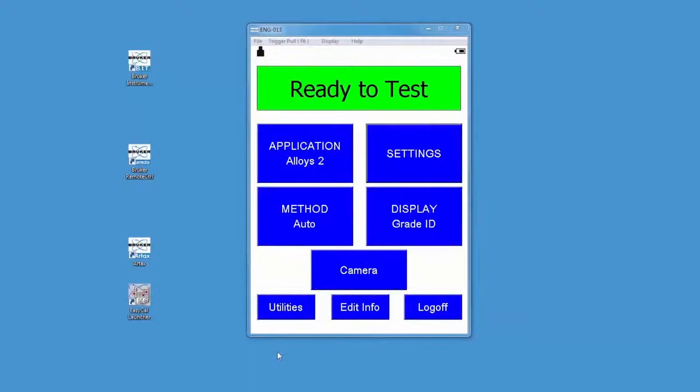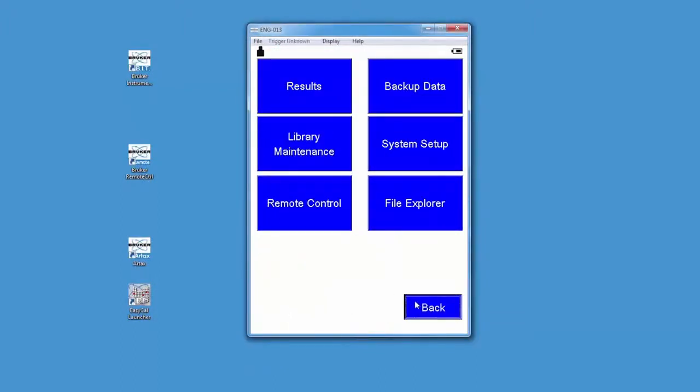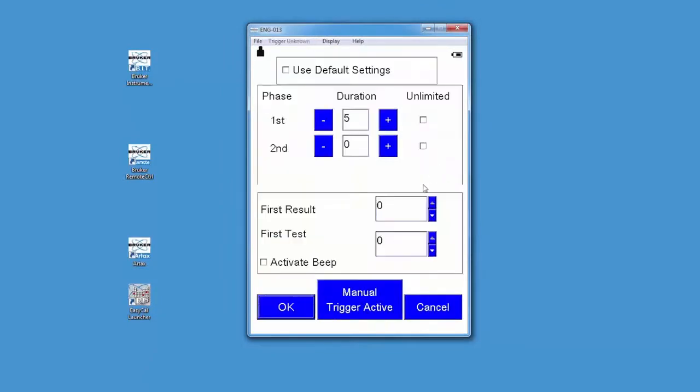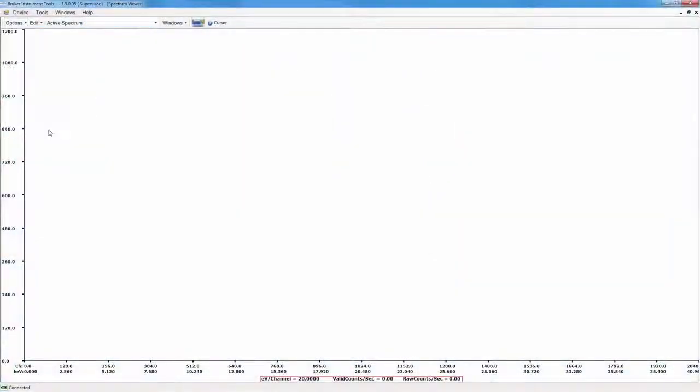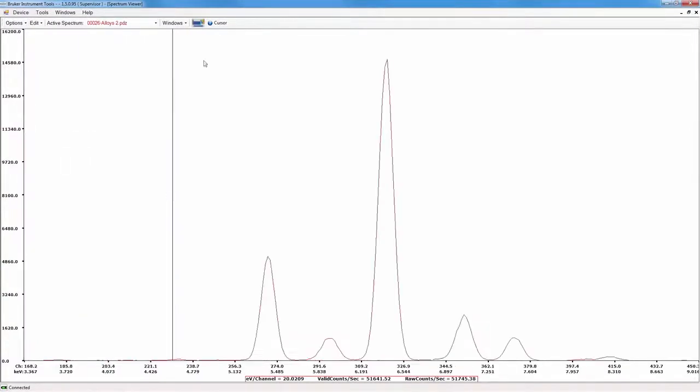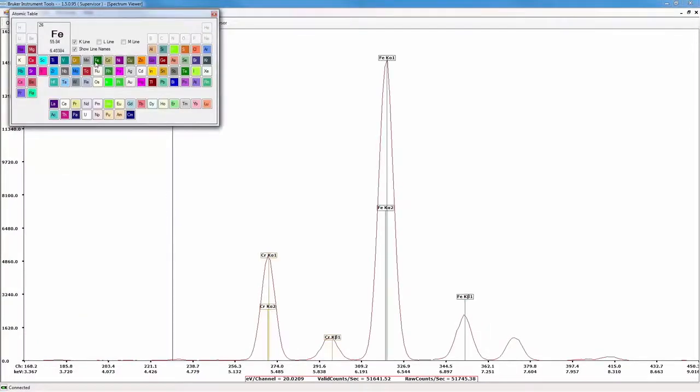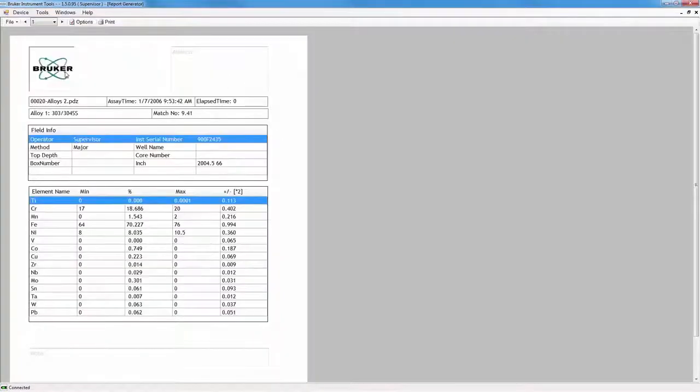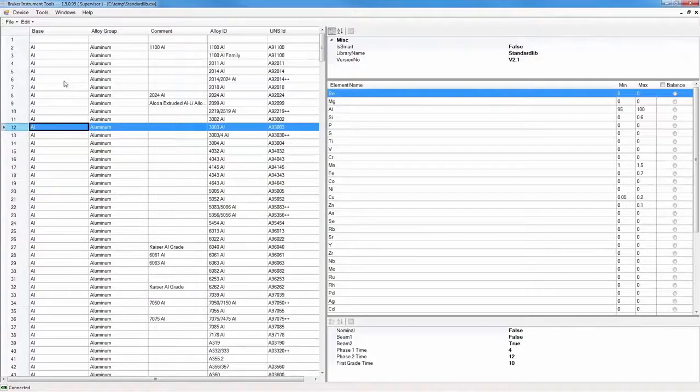Toolbox PC software incorporates remote viewing and control combined with Bruker instrument tools to provide maximum information and control of the CTX. Spectrum display, report generator, grade table editor, limits editor, and multi-user support are features of Bruker Instrument Tools PC software.